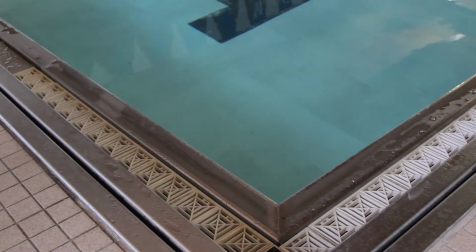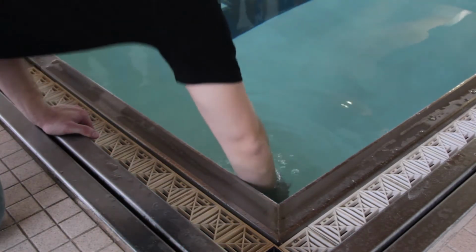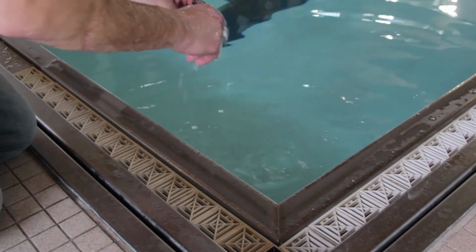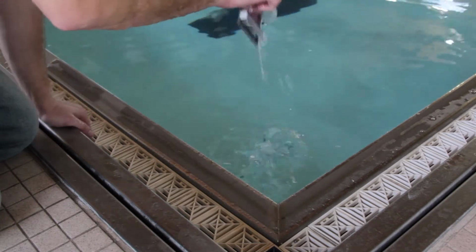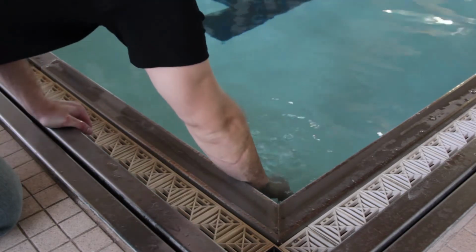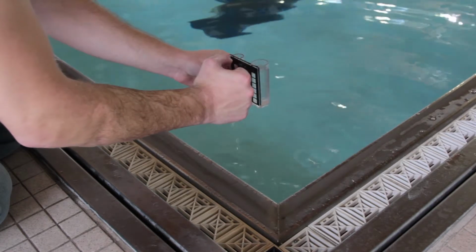Our first step will be to gather a water sample by reaching below the surface. Be sure not to stick your fingers inside the tube, as the oils from your hands will offset the pH of the sample. Instead, flick the tube to get the correct water levels.